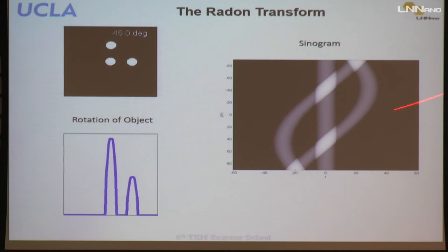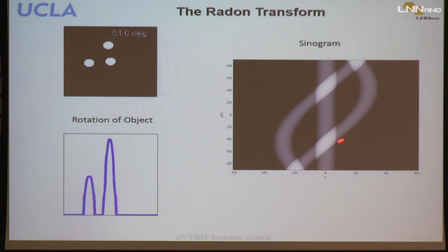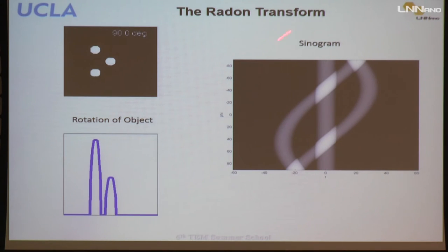So understanding this sinogram is very important. It is called a sinogram because it looks like a sinusoidal shape, like a sine curve, when projected over the entire 180 degrees of projections. So this is the Radon transform. We get the sinogram from the original object by just projection. So what we want is how we can get this original object back from this Radon transform, this set of projections. We have all the projections. Now, how can you get this original object back? That's the next important question.